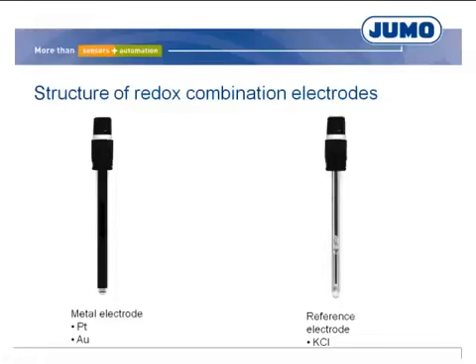The reference electrode consists of a glass or a plastic shaft and is filled with the reference electrolyte of a potassium chloride solution. The internal conduction system consists of silver-silver chloride. Reference electrolyte and conduction system form the reference system.